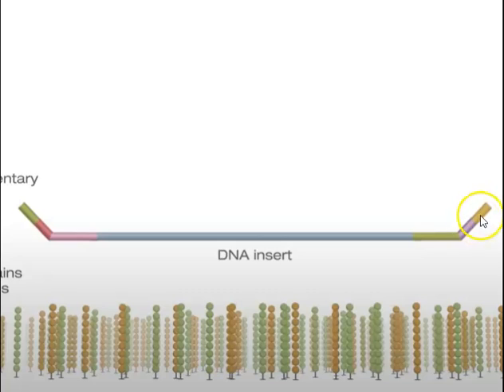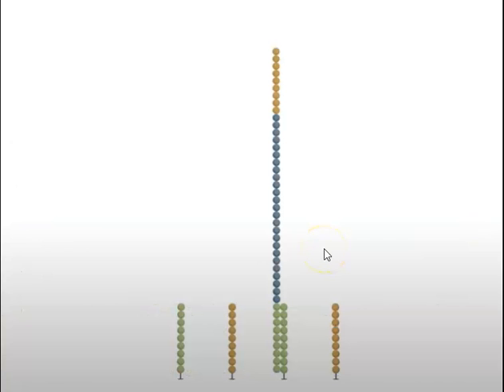These oligos have several little parts to them. One bit is for binding the oligo or primer that's attached to the glass slide, and then you've got other sections to it, so it's much more complicated than just a capture probe. There are various different parts to it which we'll see later on in the video. So we can see at this point one of the oligos on the end of the DNA for sequencing has been captured by one of the oligos on the flow cell.